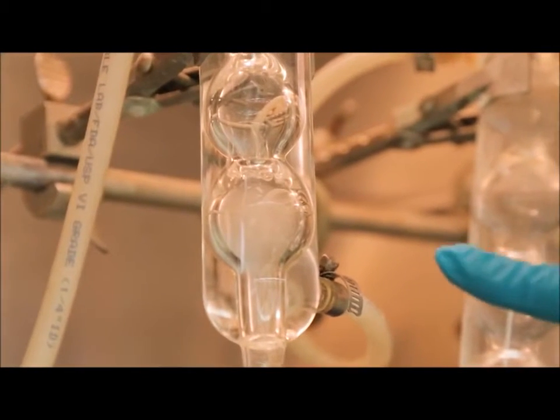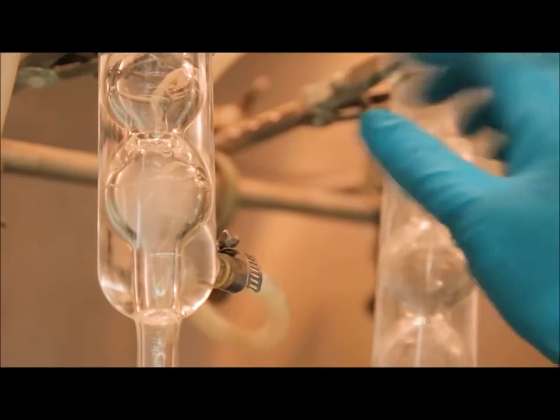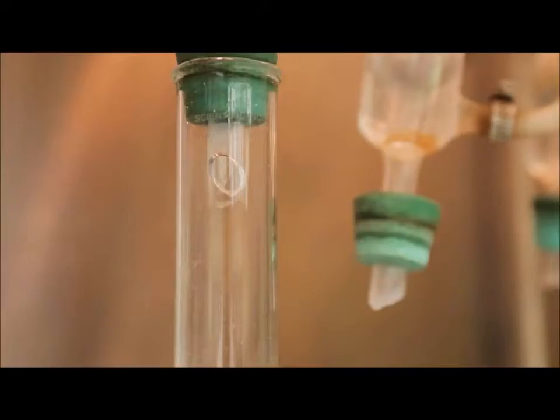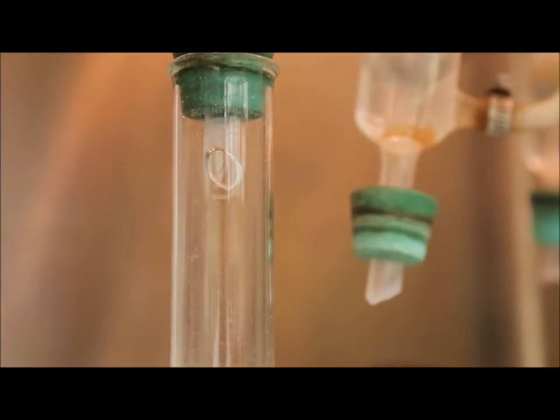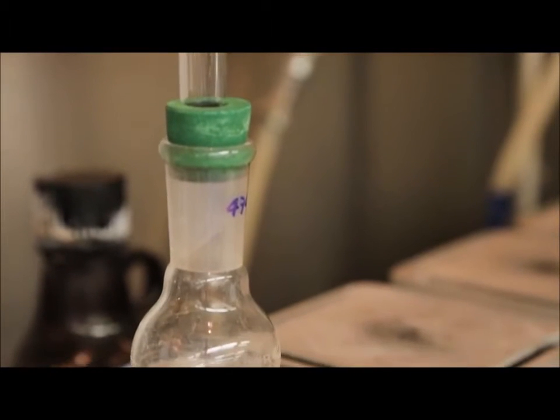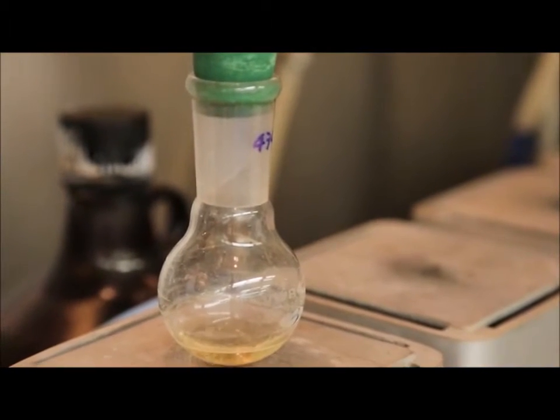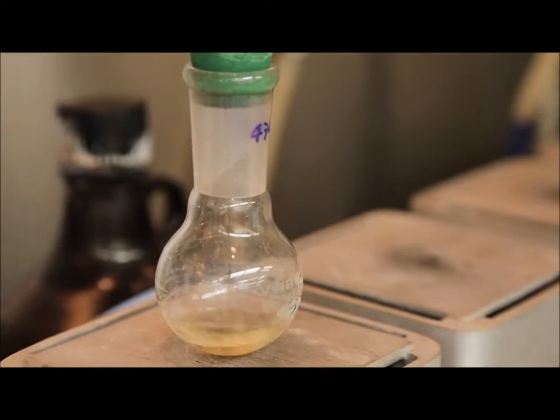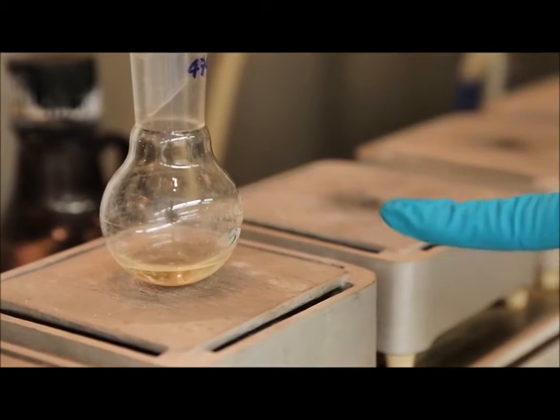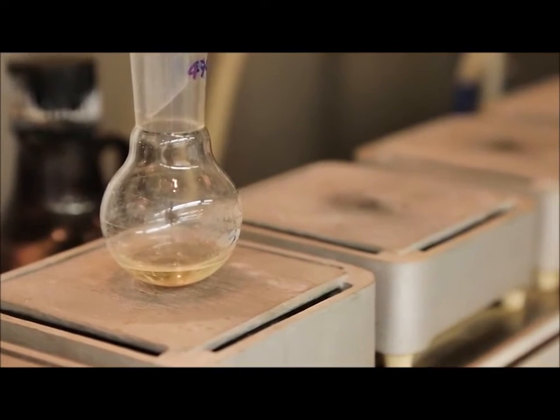During this stage, while we are refluxing, we are also saponifying the sample, which is going to release and liberate the fatty acids that may be connected to the backbones of the phospholipids and triglycerides. It is also important during the refluxing stage that you see the fat globules go into solution while boiling.